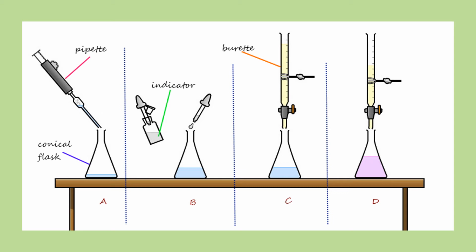Okay, so this is our pipette here. It's a long thin piece of glass with like a bulb in the middle of it. It uses one of these at the top, which is called a pipette filler. Now this does the same job as the squeezy bit at the top of the dropper. It sucks the air out of the pipette, and because this would be dipped into a flask of the vinegar, it'll pull the vinegar up, and the vinegar would get up to a point.